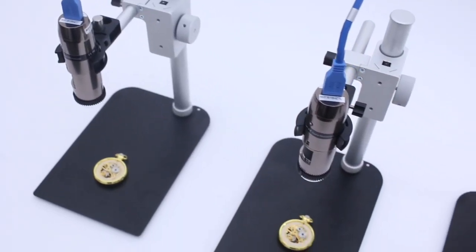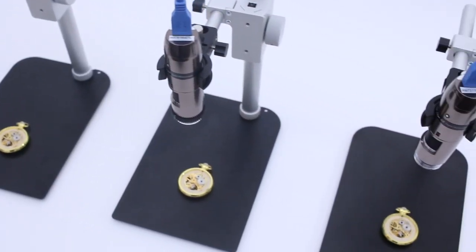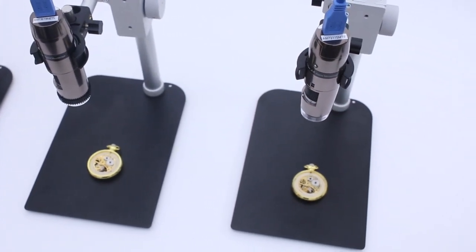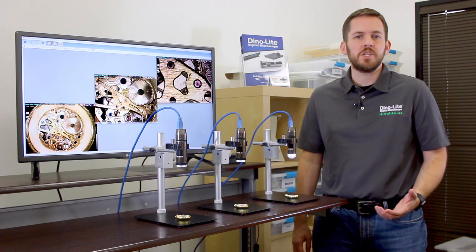Another important point to note is that each of these models can be positioned further away from the specimen and be in focus. It just won't be at as high of a magnification.